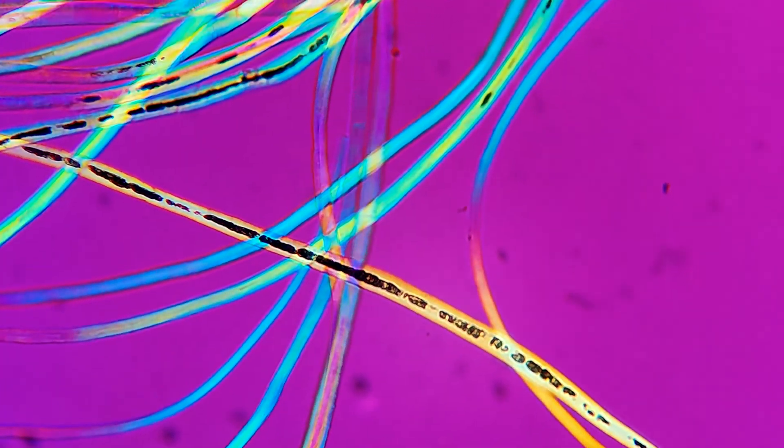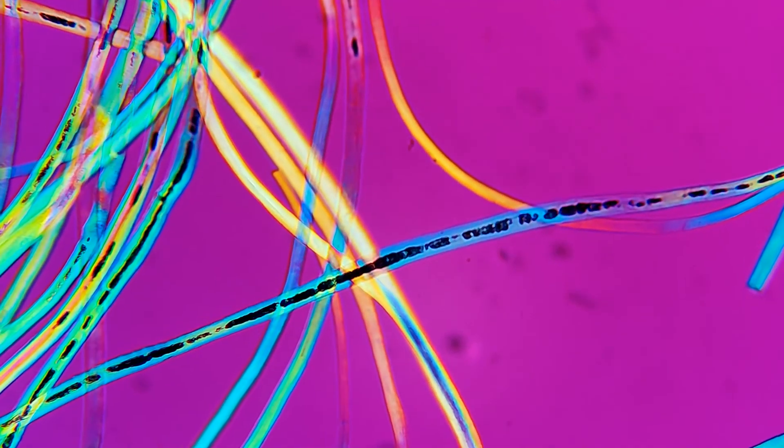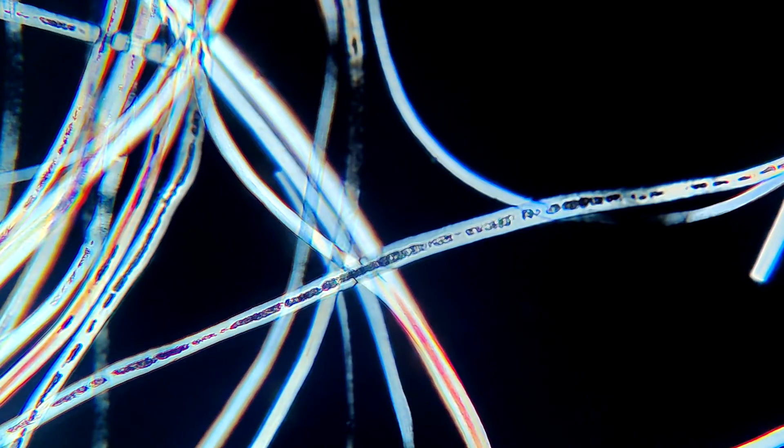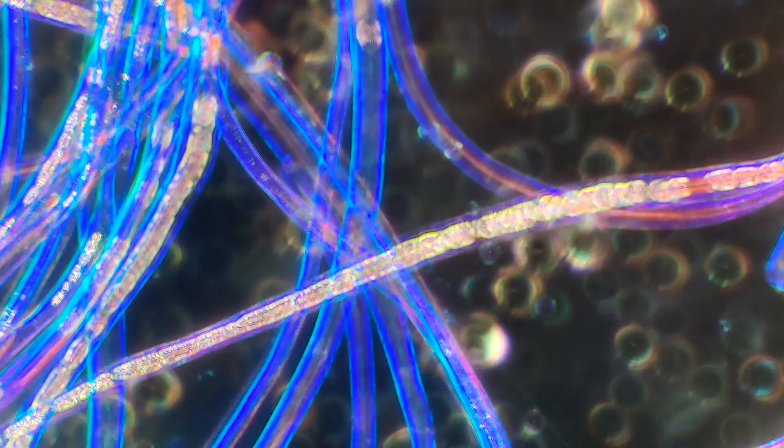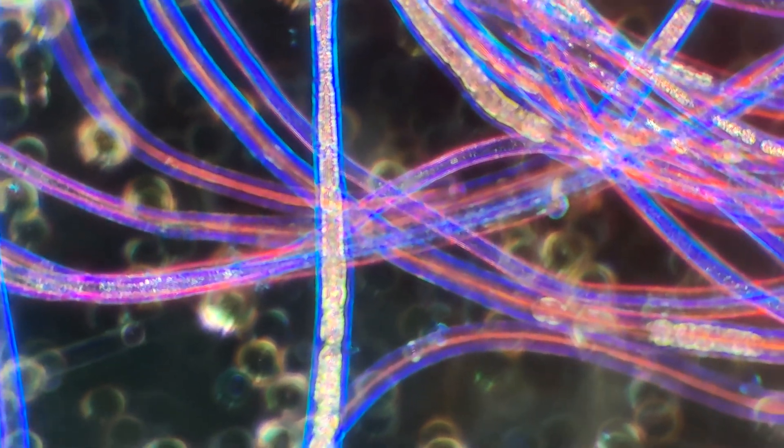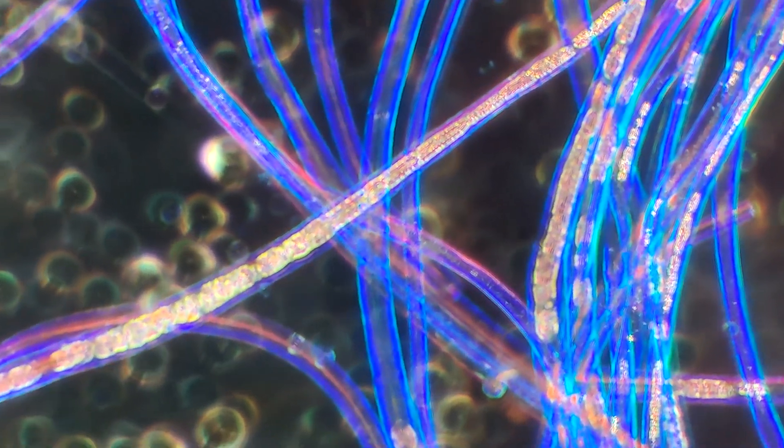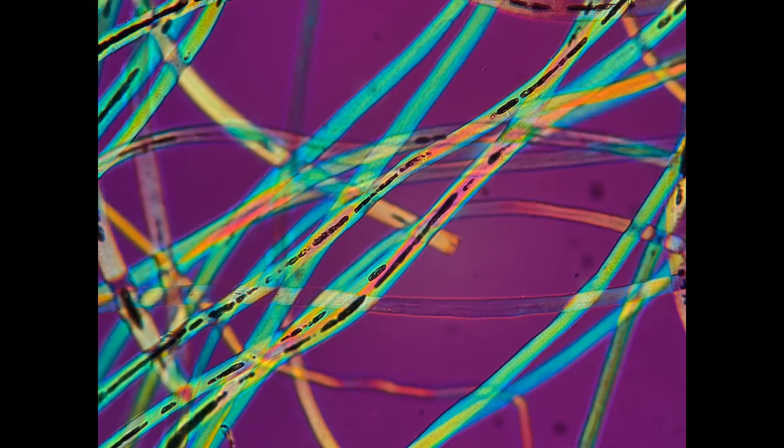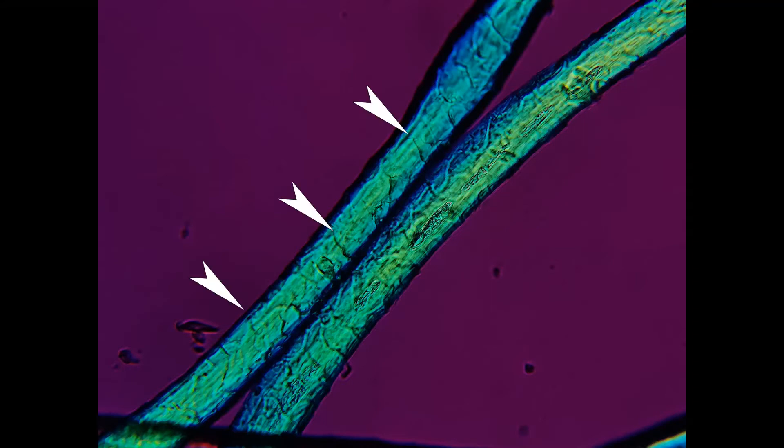Wool, like all natural hair, exhibits a positive sign of elongation, low to moderate birefringence, and a blue to magenta dispersion staining color when prepped in 1-5-5 refractive index liquid. Things that differentiate hair from other textile fibers include a medullary structure, though not all hair has these, a round oval cross-section, and cuticle scales.